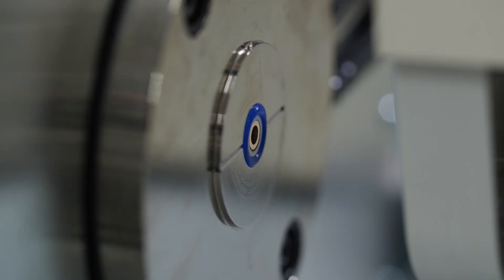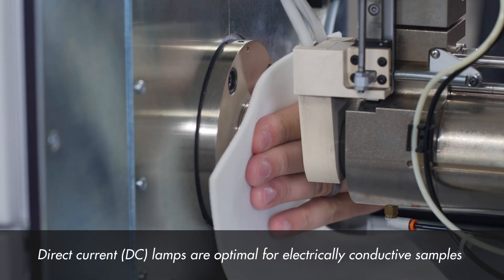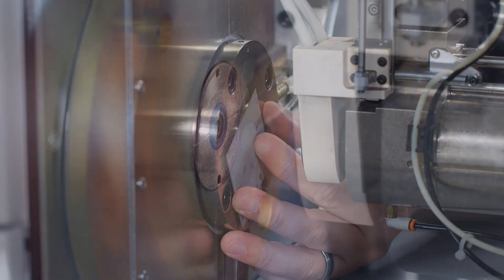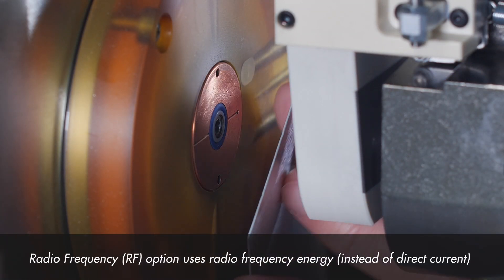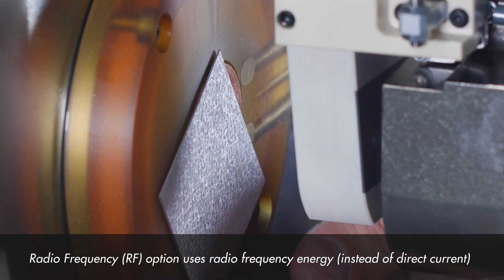Direct current lamps are standard equipment with the GDS series. DC is optimal for electrically conductive samples due to its simplicity and ease of control. Instrument models equipped with the optional radio frequency option use radio frequency energy instead of direct current to direct the glow discharge.